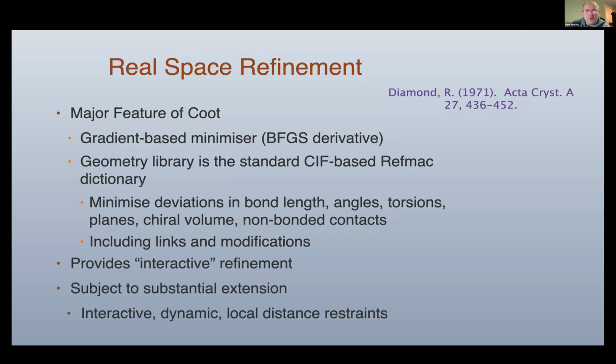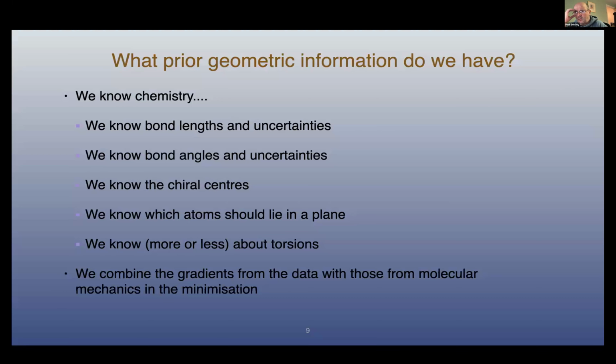And you can do things like dynamic and interactive refinement. Maybe we'll have time to look at that. I've given tutorials or seminars in the past on Zoom, and when I tried to do a demonstration, it didn't work very well. So most of this will be just normal standard PowerPoint-like. But maybe we'll have time to have a quick demo at the end. I don't know if it'll work because the frames per second have in the past made it problematic. But Pavel's animations look very nice on my screen, so maybe it'll work.